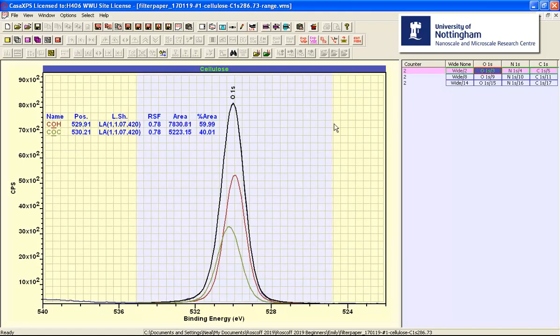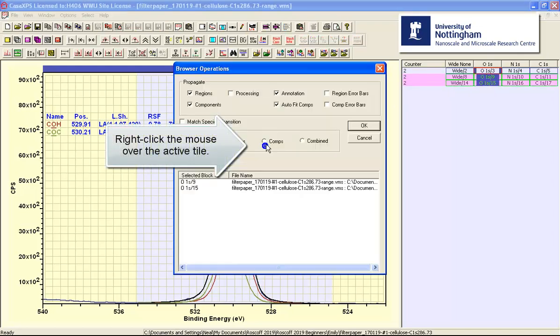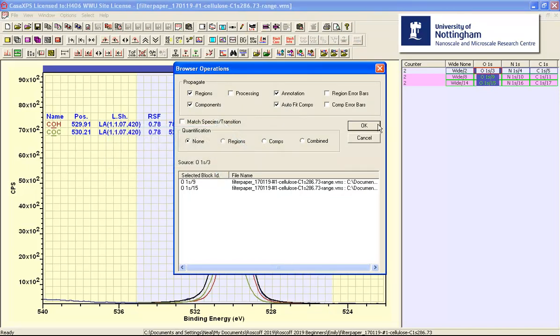If we display the oxygen in the active tile, select the two oxygen regions and then right-click, it remembers the set of propagation options that were ticked before and we say OK.